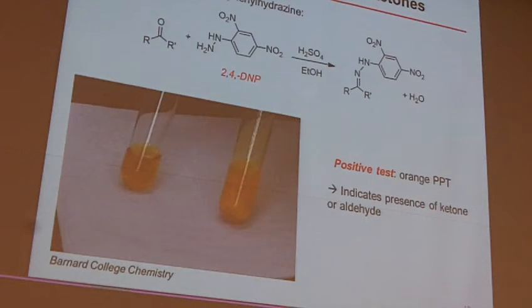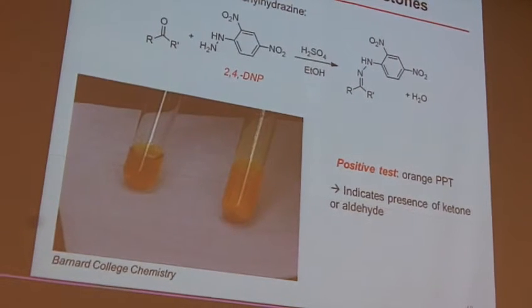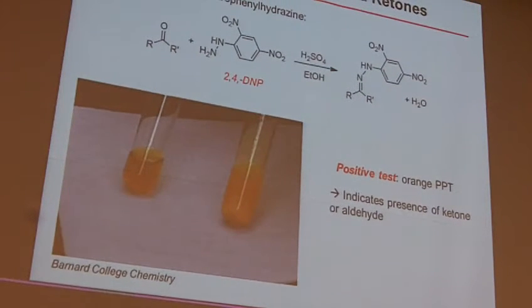Remember the little hints and tips we gave you last time? Don't use acetone to clean a test tube before you do this, because of course acetone falls nicely into the ketone category, and that will give you a positive test. So be sure you don't clean this with acetone beforehand. It's okay if there's a little watermark on your test tubes. Just go ahead and run the test. There's the reagent. That's what a positive test looks like.